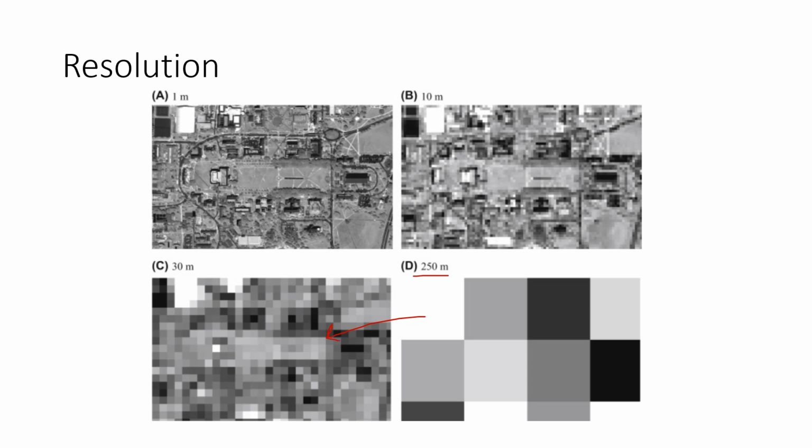But as we increase the number of pixels, as we make the array denser, as you can see in C, there is a variation of bright and dark regions, but still the image is not clear. As we move to B, by making more pixels, we are getting some sense of the image, but still it is not very clear. And as we move to A, we can certainly see that this is a map of some area. It is a top view of some area, and it is a highly resolved image. In the era of smartphones, the picture quality matters a lot, and we need more and more resolution of images. That is the purpose of designing these sophisticated devices, to get resolved images.